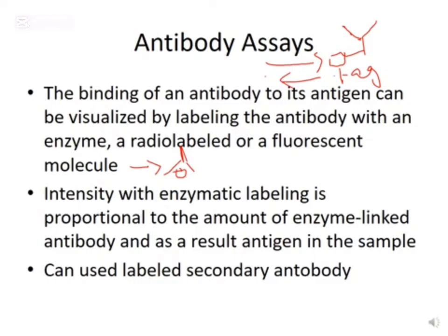So this brings us to the definition of fluorescence. If a molecule is fluorescent and we subject it to light at a certain wavelength, it's going to absorb light and emit it back at a lower energy. It's going to vibrate that light back at a certain energy.